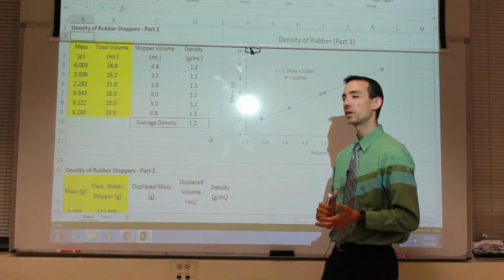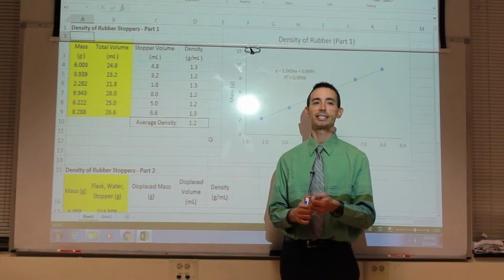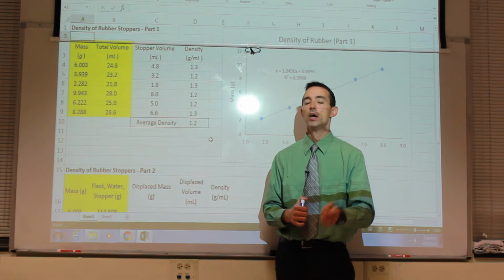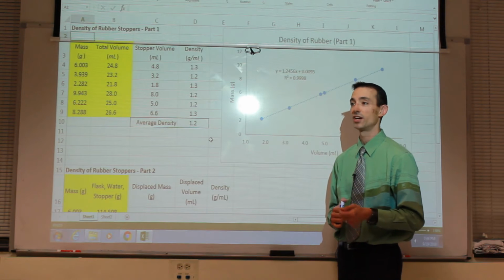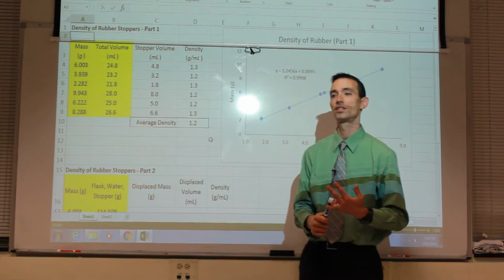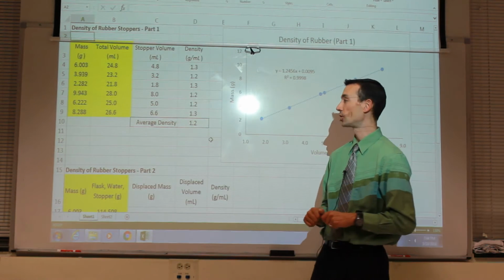The power of this spreadsheet comes in its ability to quickly reproduce the same formulaic calculation again and again and again. While you might be able to do 1 or 2 calculations on your calculator faster, when you have to start doing 6, 10, 20 calculations, that's when the spreadsheet's gonna start to win. And so that's what we're going to be showing you.